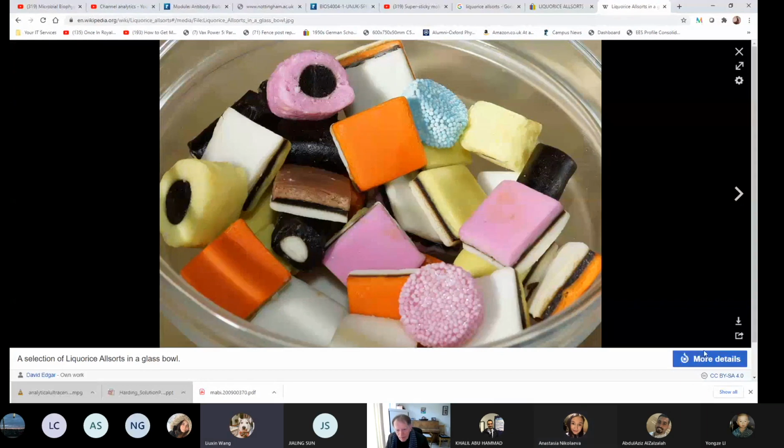See that one there? The bead shell model. Looks a bit like an FC fragment. This could be your hinge region here. So that's a slight digression, folks.